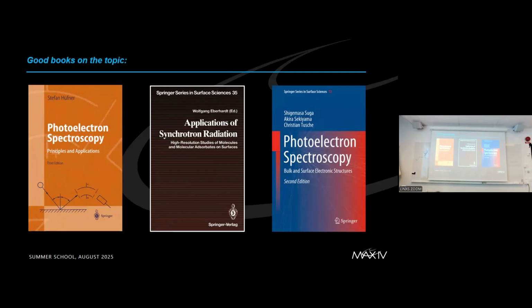The absolute hit here is the book by Stefan Hüfner, Photoelectron Spectroscopy. If you want to learn photoelectron spectroscopy properly and use it in your everyday scientific analysis and instrumentation, then you should certainly read this book because it covers all aspects of photoelectron spectroscopy.